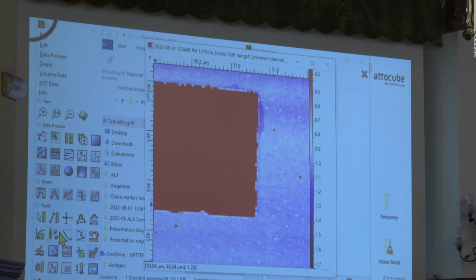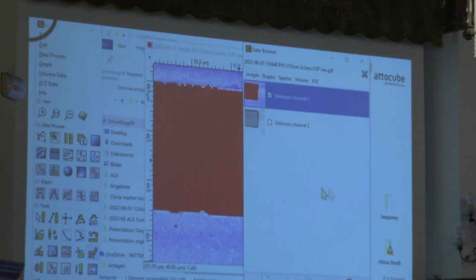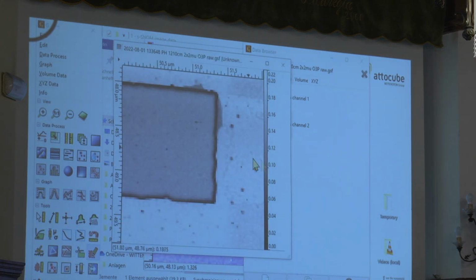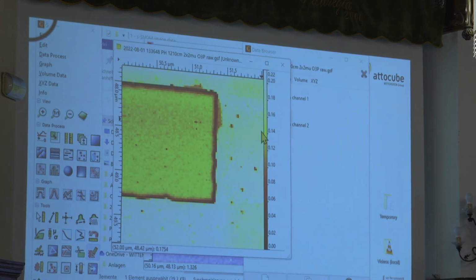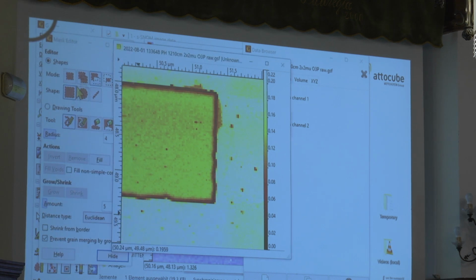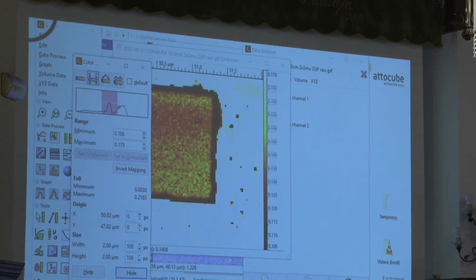So let's do this. We can check maybe. We can open the amplitude of this. Yeah, here's the optical amplitude. And we can see already from the scale bar the values. It's some strange numbers where we don't know what they mean. What does an amplitude of 0.2 mean? It's unclear. So that's why we can again select an area, or maybe we can zoom into the substrate here.